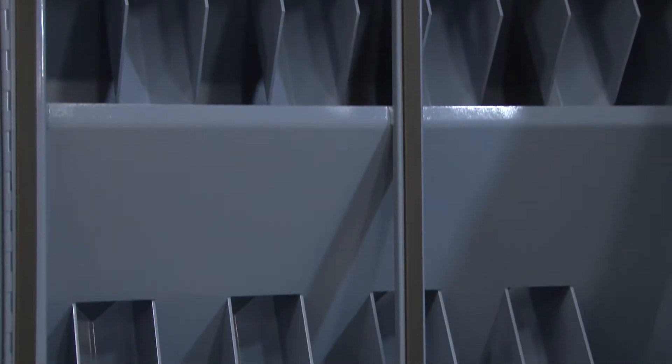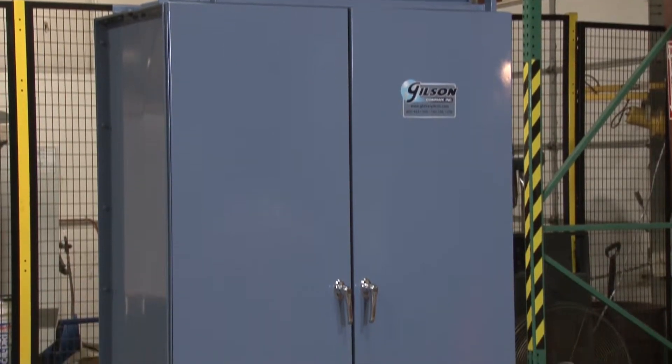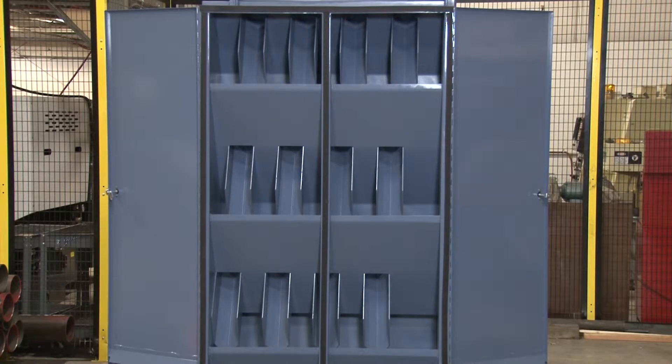The chutes are constructed of heavy welded steel, and the front door panels assure superior dust control and swing wide open for easy cleaning.